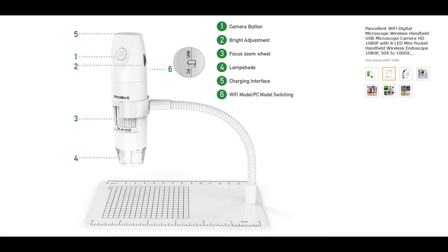We will use totally three different microscopes and we will start with this one you see on the screen. It is a USB microscope that has a zoom range from 50 times to 1,000 times according to the specifications. So I will just quickly show you how it looks when holding this microscope against your skin or in this case my beard.